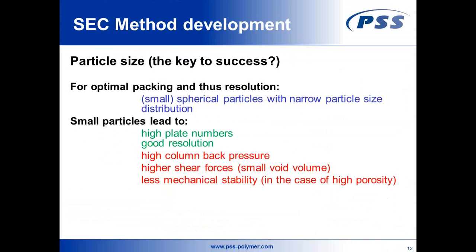You can't go to very, very small particle sizes, because when the particle size gets too small, I have unfortunately no time to go into detail in general, we could shear our samples size-wise, and mechanical stress could also cause some instabilities to your column bed itself.